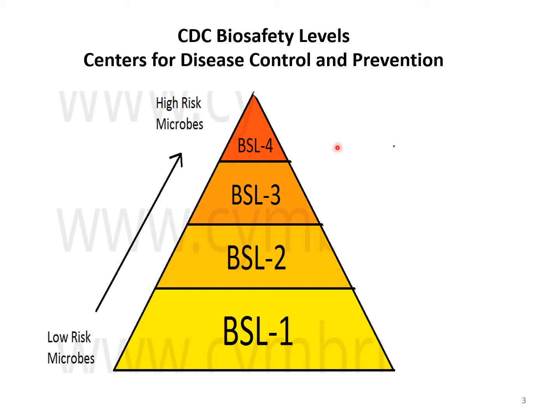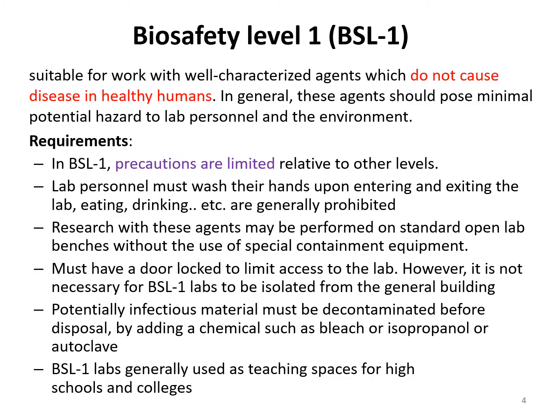The pathogens that fall under BSL4 are very severe. For instance, COVID-19 is placed under BSL4, while E. coli, some Saccharomyces, and other non-pathogenic organisms usually fall under BSL1, and some phytopathogens that can cause potential injury fall in between. We will discuss all this information for each level in the coming slides.